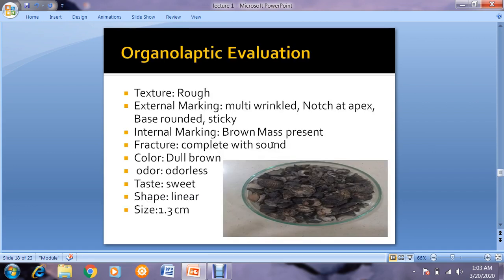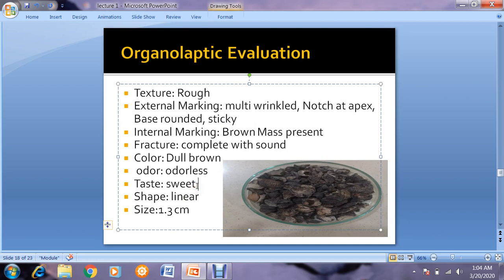Organoleptic evaluation: texture is rough. External marking — multi-wrinkled, notch at the apex, base is rounded. It is sticky. Internal marking — brown mass, fracture is complete with sound. Color is dull brown, odor is odorless, taste is sweet and sour. Shape is linear to crescent and size is 1.3 centimeters.